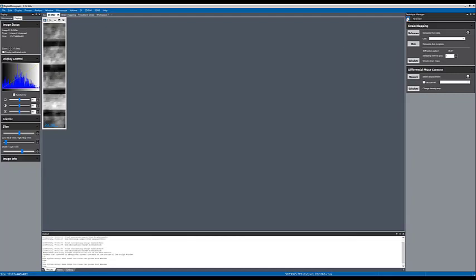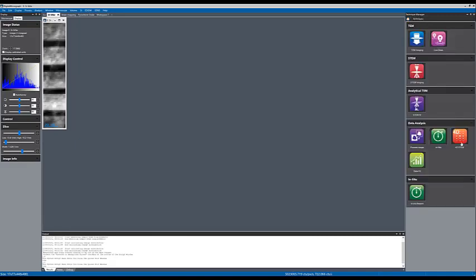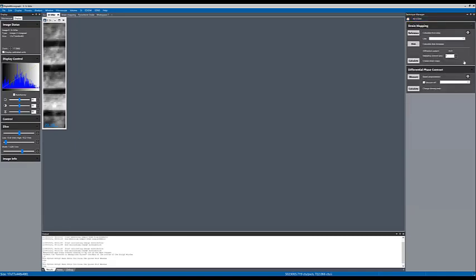For strain mapping, as I said earlier, we use the 4D STEM technique and go to the strain mapping window. And you just follow the workflow from top to the bottom of the strain mapping technique window. So again, the way we do this is calculate a reference diffraction pattern and compare the diffraction patterns in the rest of the areas of the sample to this reference pattern.